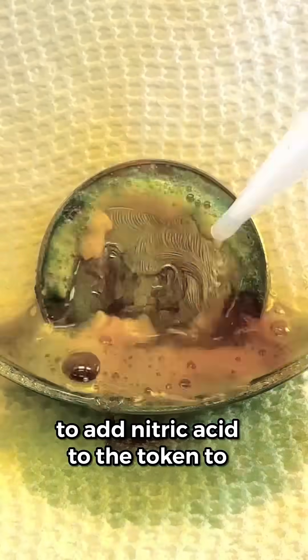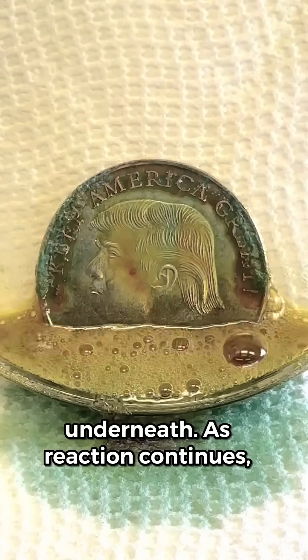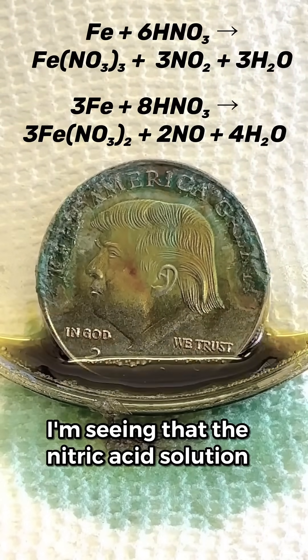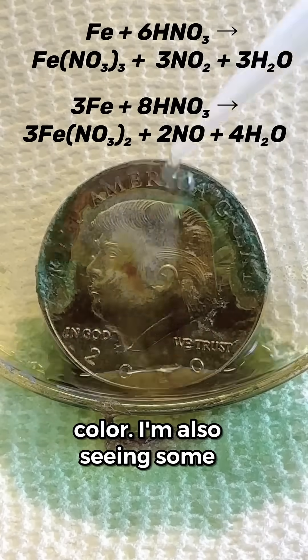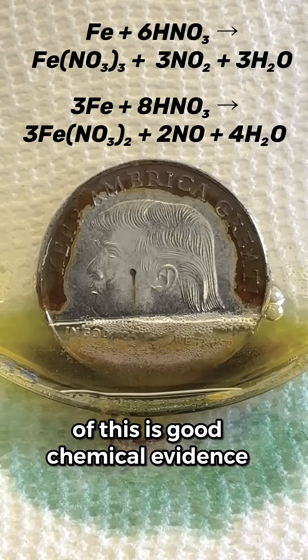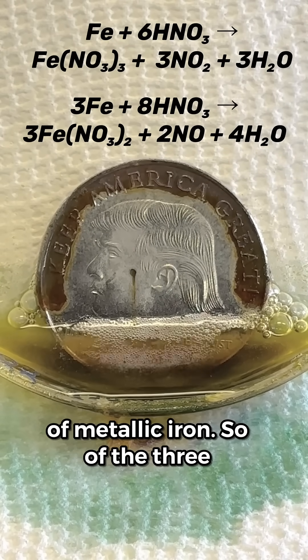Let's continue to add nitric acid to the token to dissolve away the copper layer and see what's going on with the metal underneath. As the reaction continues, I'm seeing that the nitric acid solution has changed to a greenish-brown color. I'm also seeing some oxidation on the surface of the token that looks a lot like rust. All of this is good chemical evidence that the token consists primarily of metallic iron.